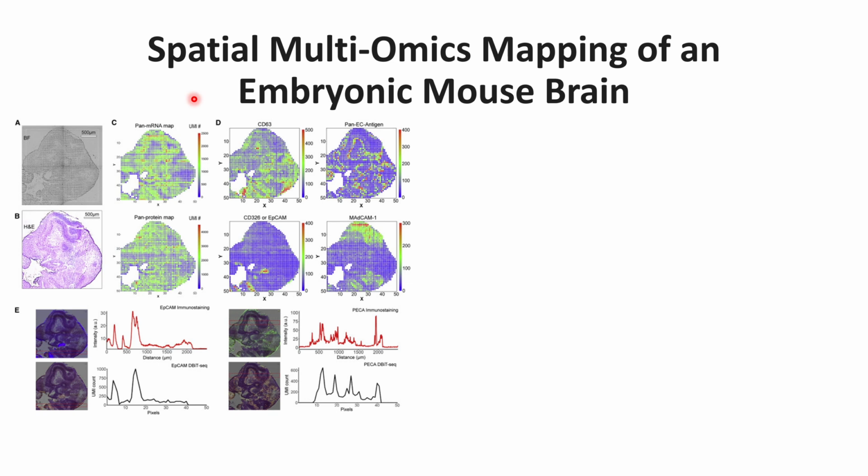Next, after doing the whole embryo, they next focused on a specific organ of the mouse. So they focused on the brain of the mouse using the 50 micrometer channel.